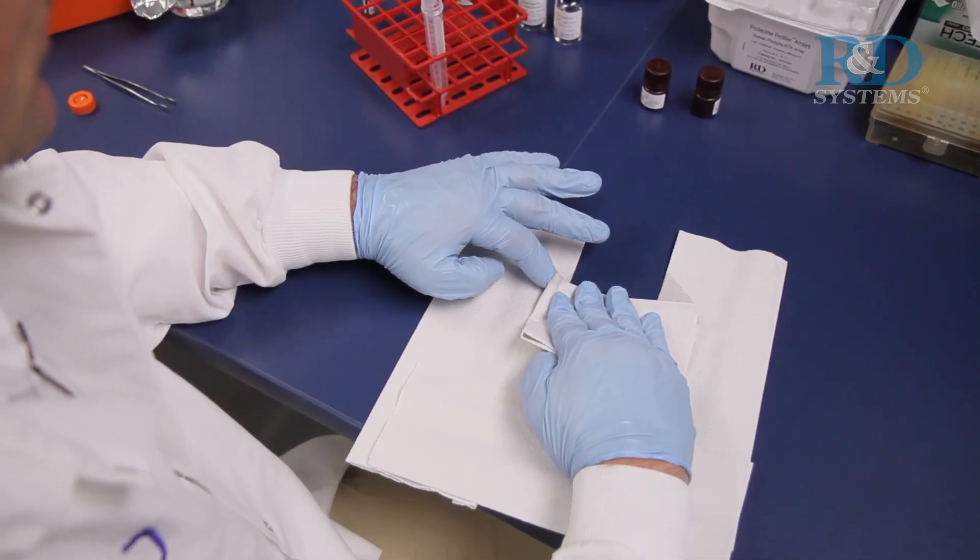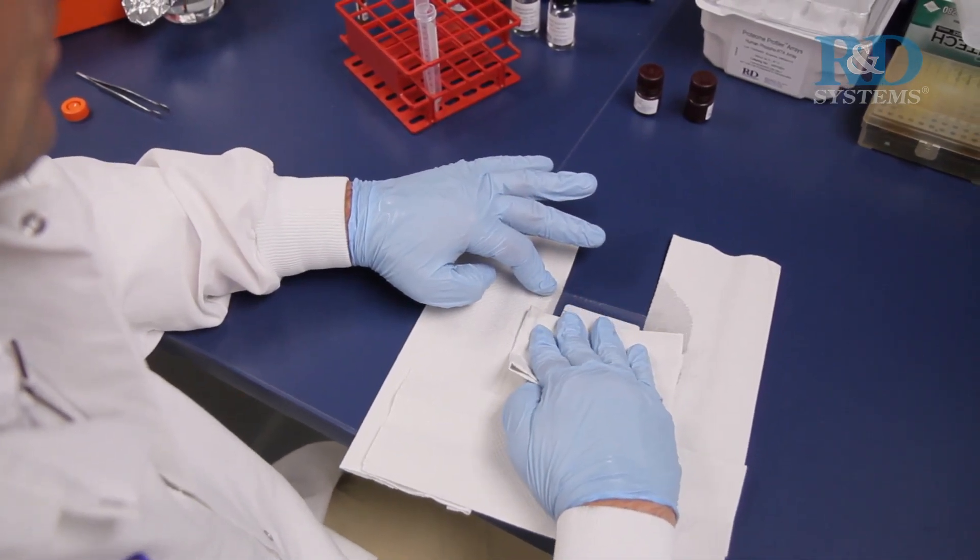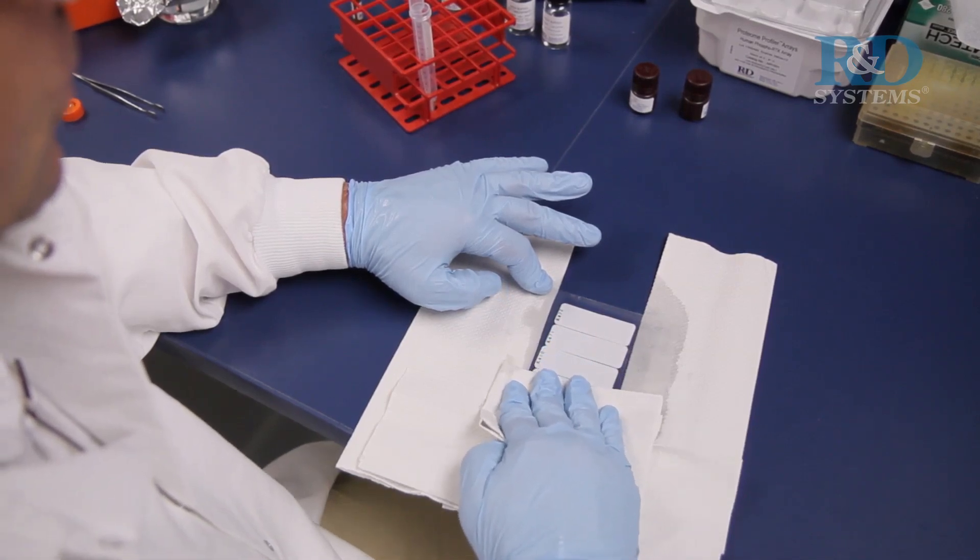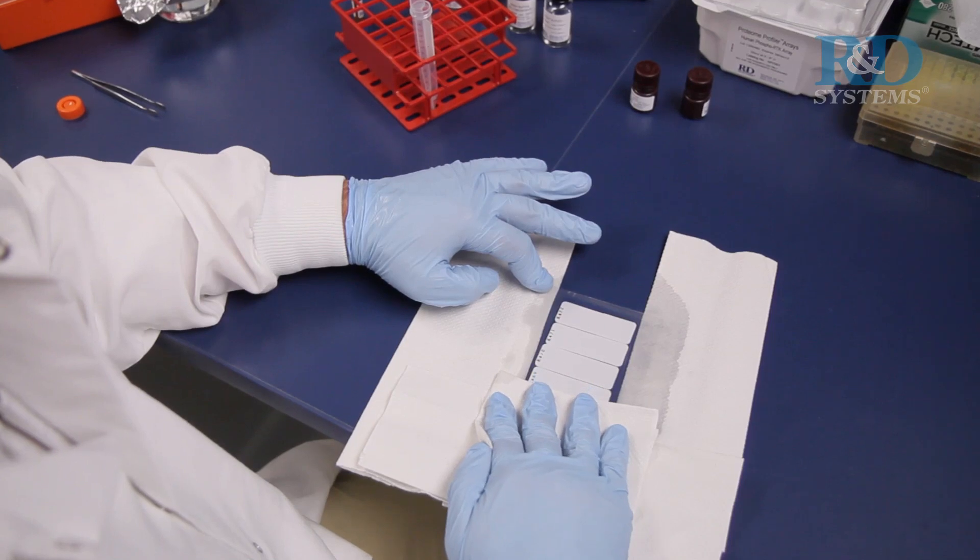Next, position paper towels on top and on the sides of the plastic sheet protector containing the membranes. And carefully squeeze out excess chemireagent mix.